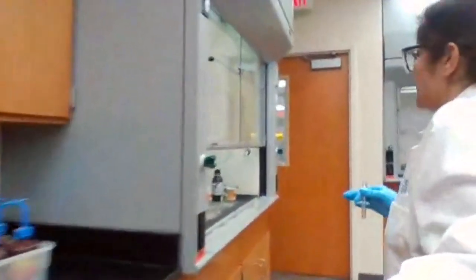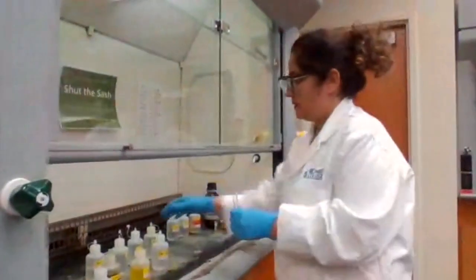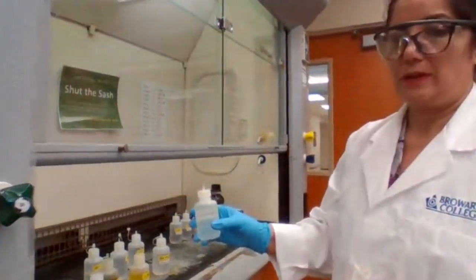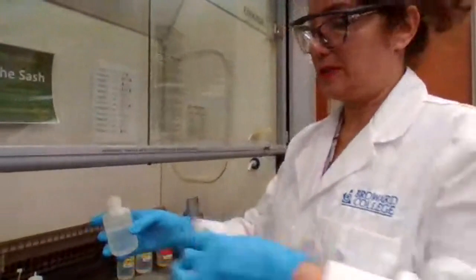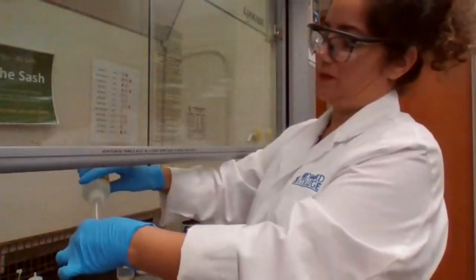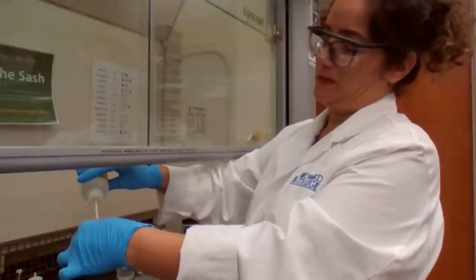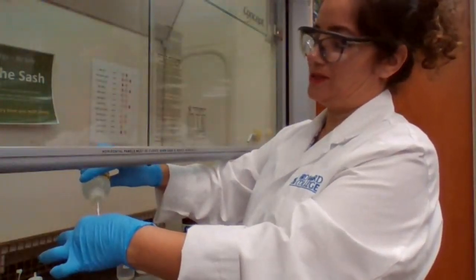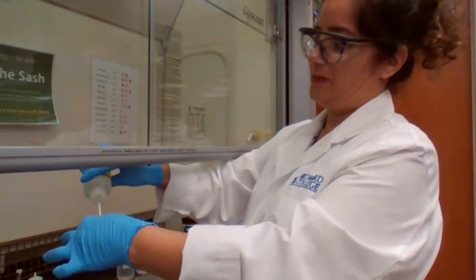Adding nitric acid: 1, 2, 3, 4, 5, 6, 7, 8, 9. The solution must change to acidic. It must be acidic.